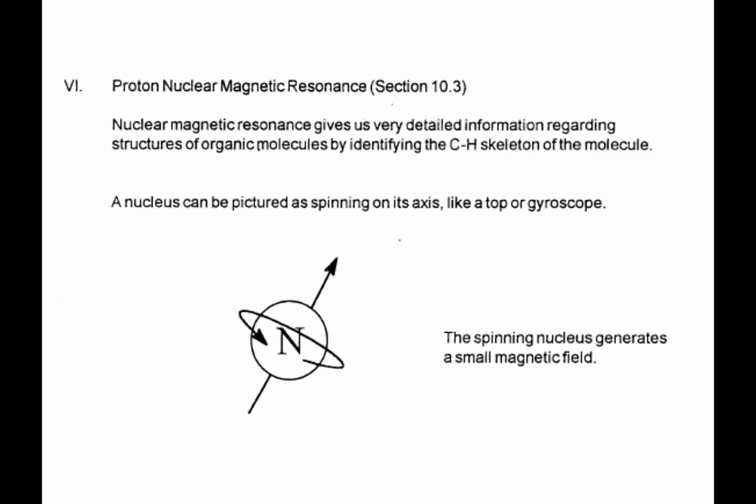So, nuclear magnetic resonance. Nuclear magnetic resonance is abbreviated as NMR. There's no radiation involved. It's not nuclear.